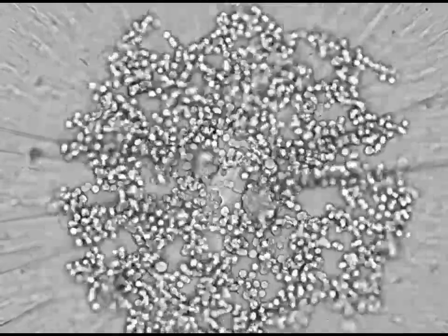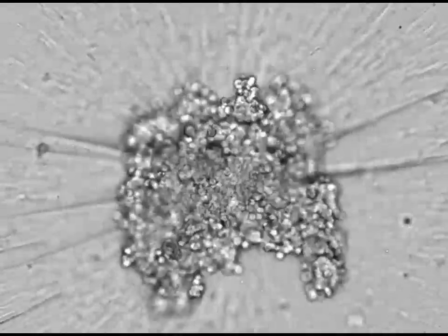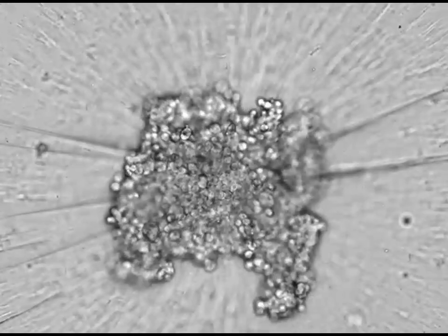So again, you can see over time how the cells easily aggregate into a single spheroid or tumoroid type of configuration. Then following the completion of aggregation, these can then be used for performing whatever assay that you see fit.